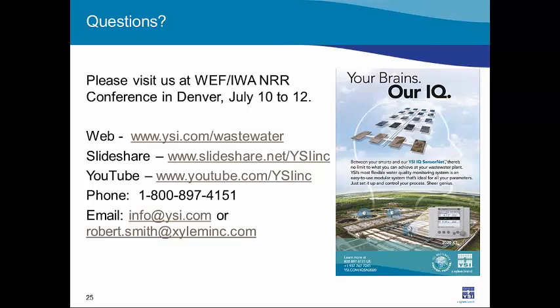However, on the lower end, if you just wanted to monitor nitrate or just NOx, you'd be closer to $12,000 as a list price. Now, to contrast that with an ISE, which is your other option, an ISE just for nitrate is going to cost from us a list price of around $5,000. Actually, probably a little less than that. So there is a significant price difference depending on what it is you want to monitor.